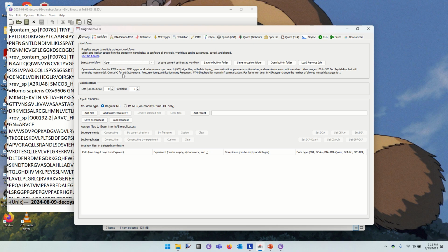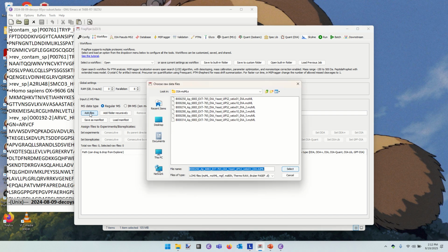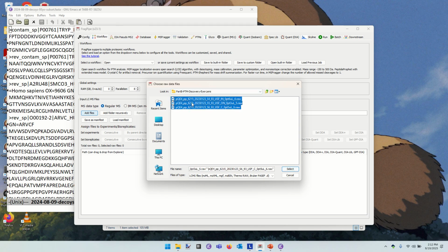Now that I'm in version 23, I no longer have to click load this option. That's good. But now I can add the files for this particular run. Okay, so we don't want to do the part A changes. We want to do part B. And in this case, they're already expanded out because we didn't zip these in the first place.